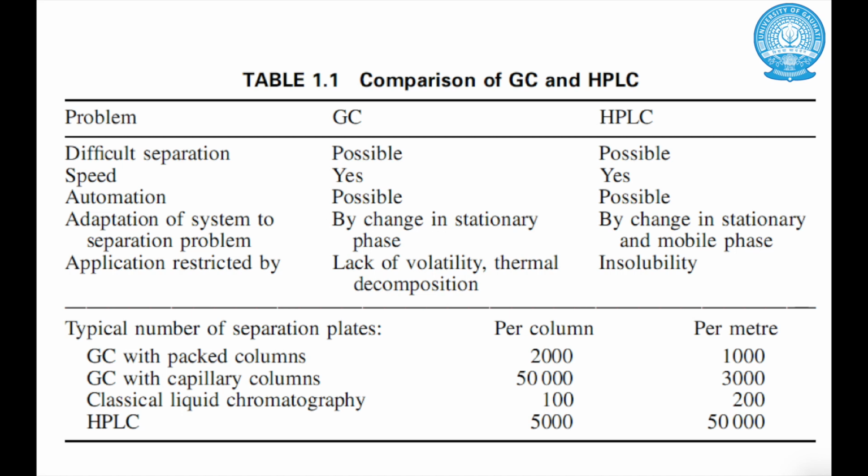However, in a gas chromatograph the columns used are quite long, so there will be more possibility of theoretical plates, because of which there will be better separation in a gas chromatograph. So among these two techniques, the sensitivity of gas chromatography is in general more than that of HPLC.